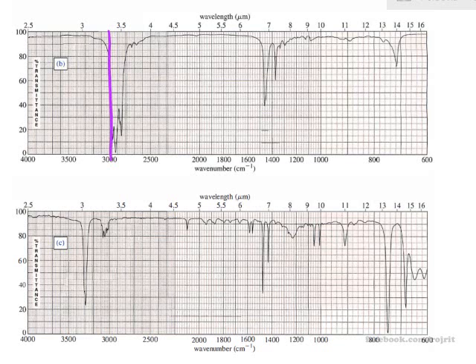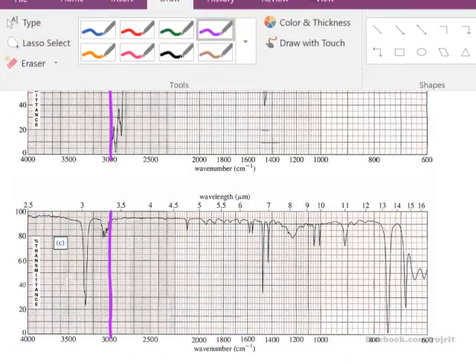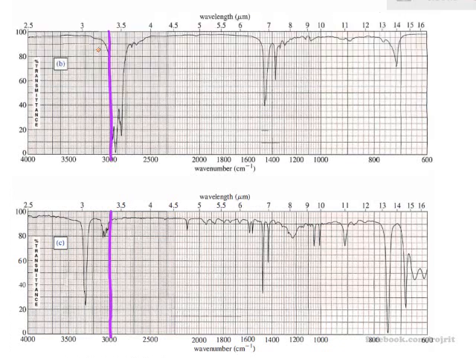I really love this one, actually. First of all, mark 3000. As you can see, nothing less than 3000 here. So there is no alkane in the chain, right? There is only, first of all, alkene and alkyne, no? So I will go to the alkyne first. This is the alkyne characteristic at 3300, right? So it's the terminal alkyne, okay?